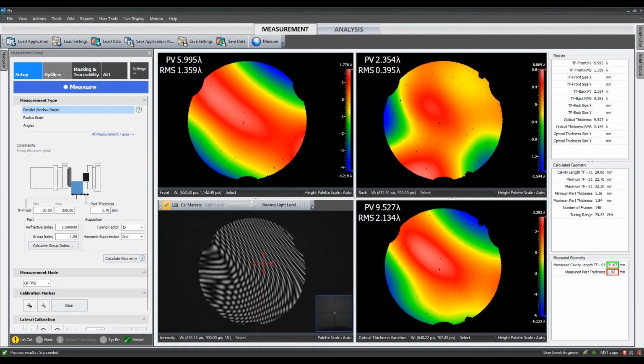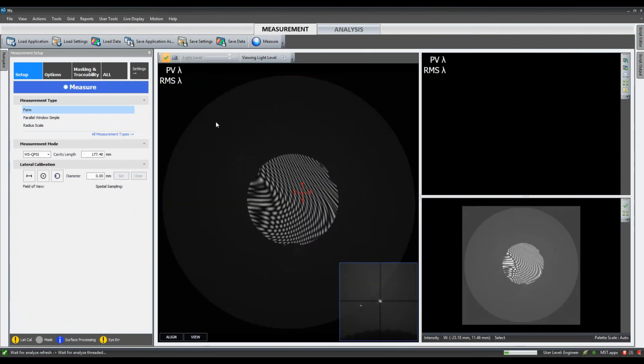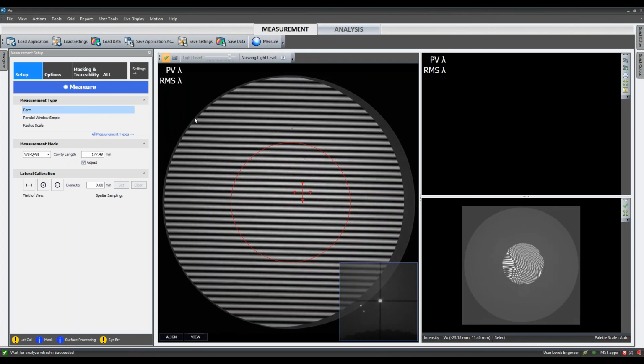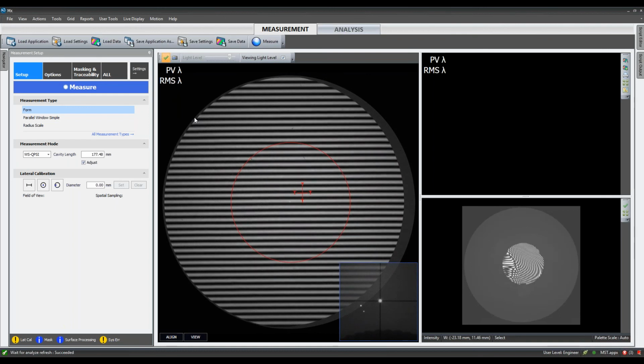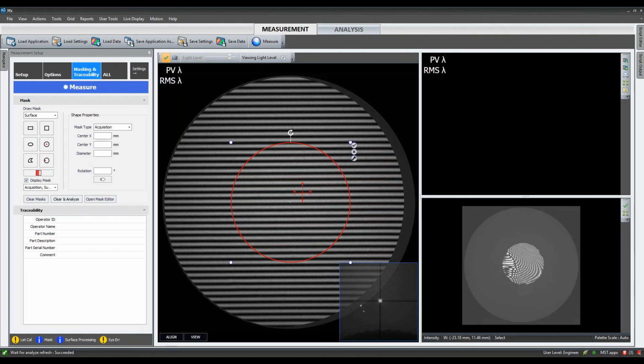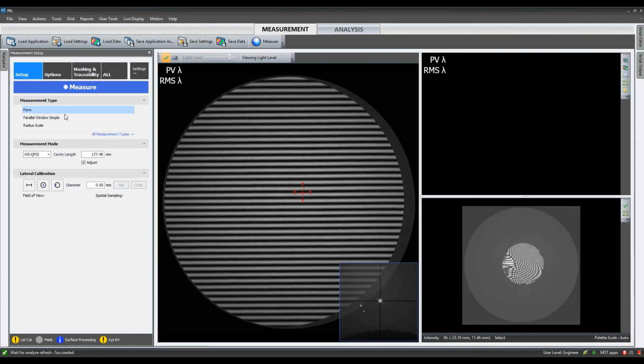Okay, a question about smart averaging. Yeah, so let's go back to a form measurement. And I'm just going to throw the transmission flat, a little simpler cavity here. This is where that picture-in-picture comes in, very handy. All right. We can delete that.